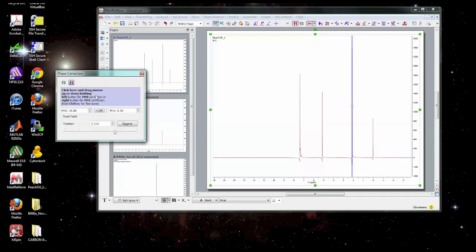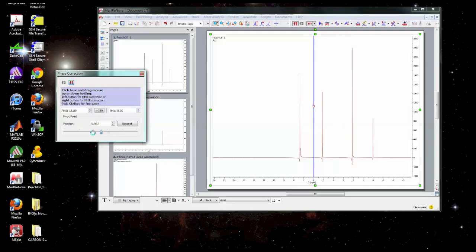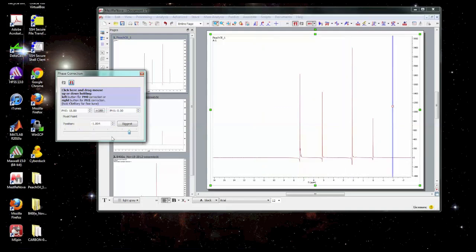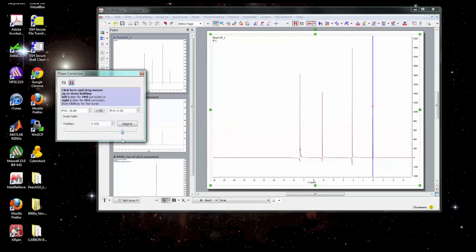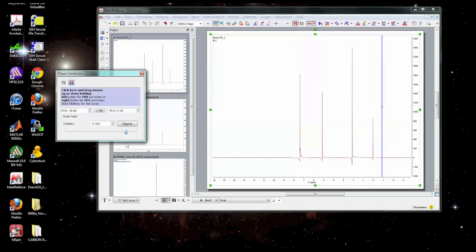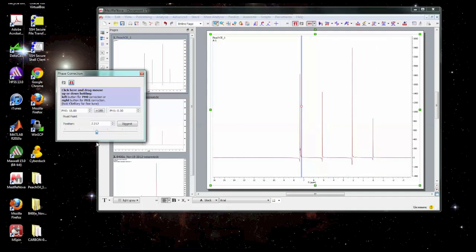So we need to click inside this box and drag the mouse up or down. And it says left button will do the zero order phase correction and right button will do the first order phase correction. You'll also see that this line appears which is the pivot point. We can use this slider here to adjust the pivot point. Normally we want to set the pivot point to some peak in the spectrum either at the right hand edge or the left hand edge of the spectrum although it doesn't really matter where you set it as long as you know what you're doing. We'll put it on this one.